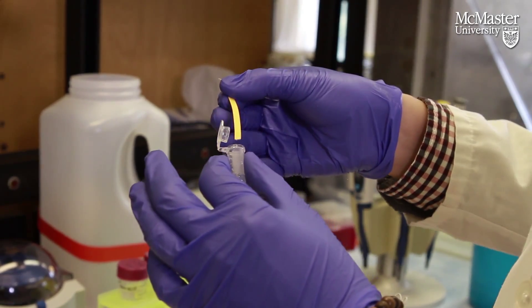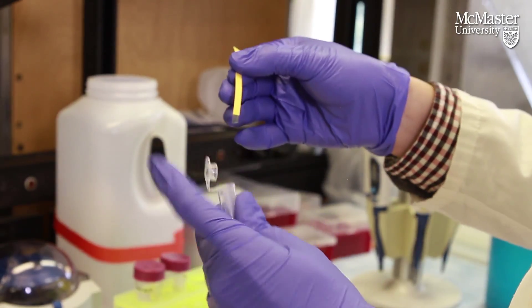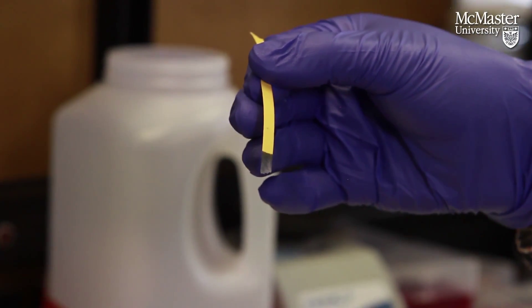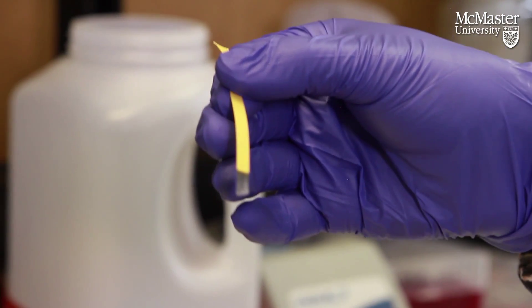In the presence of E. coli, it should turn this dark blue color. And it should remain yellow if there's nothing there.